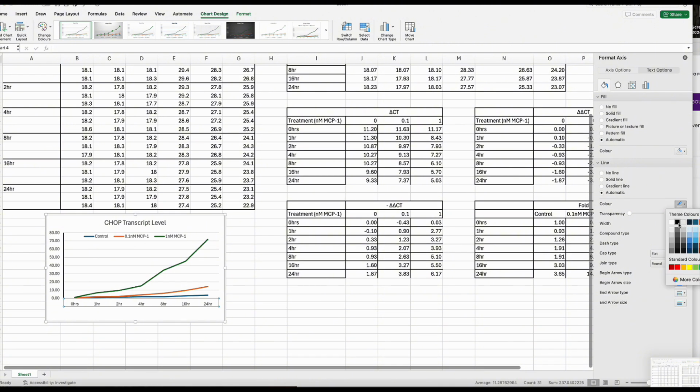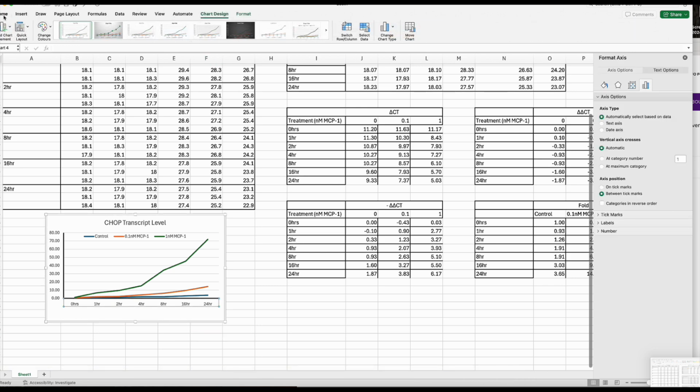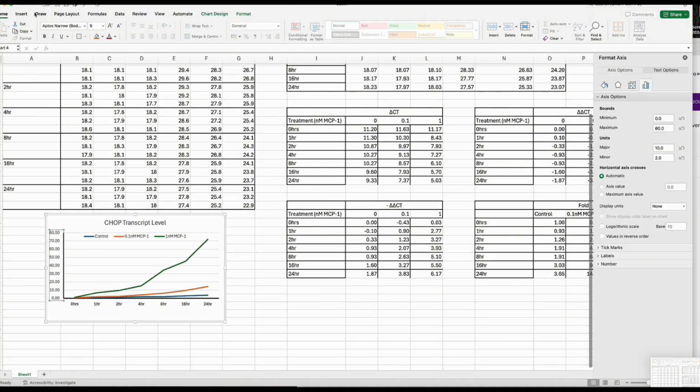Again, I'm going to choose a black font, and I'm going to use a 2-point weighted value, so it's easier to see. And it's all about your reader and what's easy for them to see. So one thing I want to do is I always like to bolden my terms, again, to make it easier for everybody to see. This is a little clustered to me. I don't think you need all these values in 10.